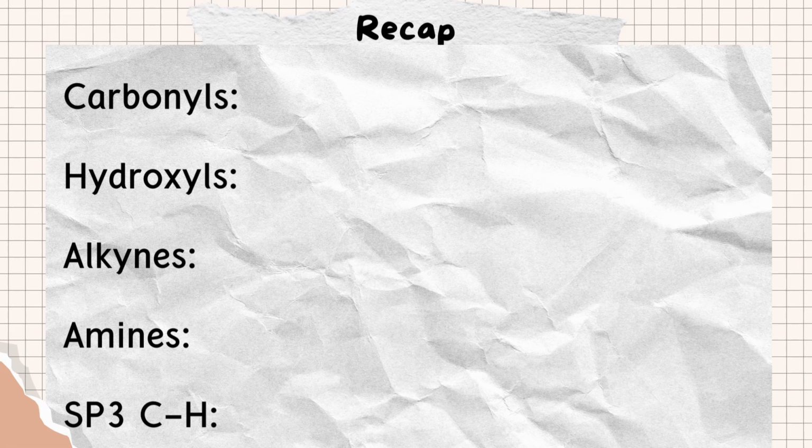Now, to recap, why don't you help me out and test your memory? Help me label the 5 major IR signals with the general wave number you'd find them at, and the general appearance of those peaks. This is helpful practice in case you get IR spec questions that are written instead of graphical. Feel free to pause the video here if you need some time.